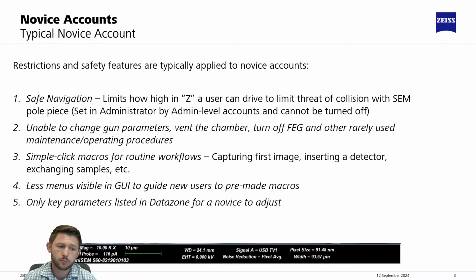Third point is that these simple click macros for routine workflows, which we'll show in action in a second, for capturing a first image, inserting a specific detector, or exchanging samples, will be out in the open. They would be right in that toolbar with a nice visible button with helpful text for the user to click on and be able to navigate to without issue.